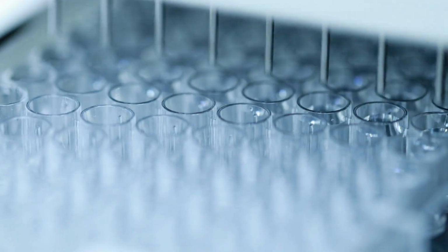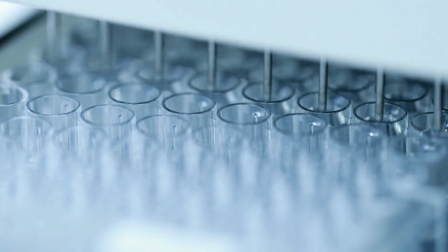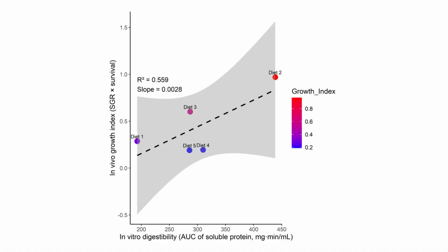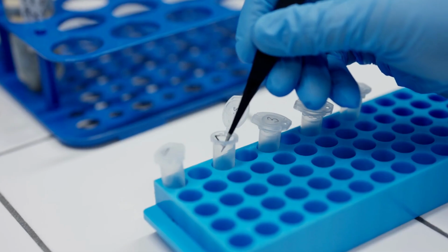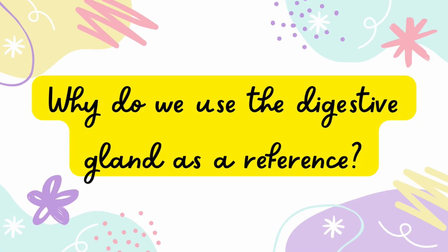This model not only reproduces the natural enzymatic dynamics but also showed a high correlation with in vivo assay results, validating its use as a reliable, cost-effective, and ethical tool for assessing digestibility and nutrient bioavailability. Why do we use the digestive gland as a reference?